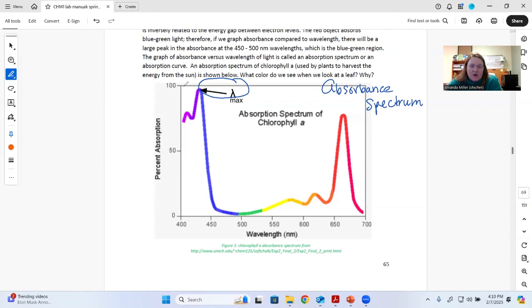If we measured a wavelength anywhere else, it's not going to be very consistent, which makes it difficult to draw any conclusions about concentration. So lambda max is where we mark the highest absorbance on the absorbance spectrum, okay? That needs to get written down in your notebook because it's going to be used to make the next kind of curve, which is called a standardization curve. Okay, curve and graph are synonymous for us.